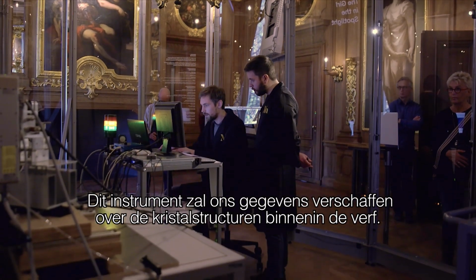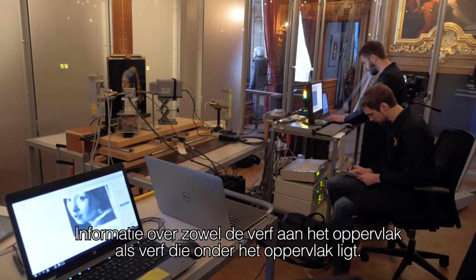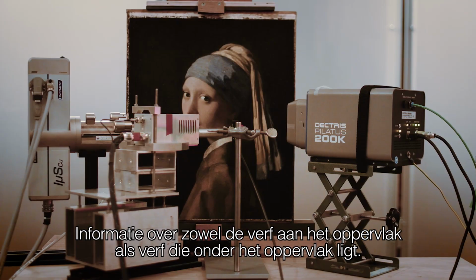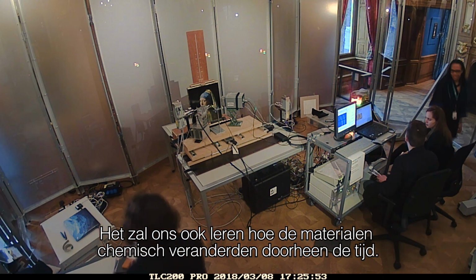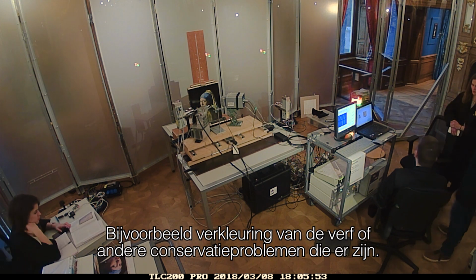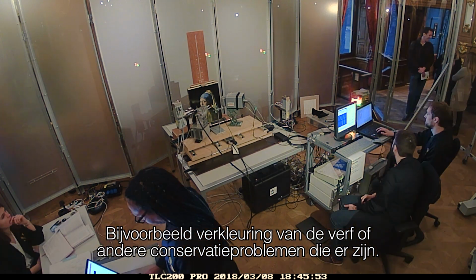This instrument will give us information about the crystalline compounds inside the paint stratigraphy. It will give us information about the painting materials which are present at the surface, but also the painting materials which remain hidden under the surface. It will also tell us how these materials have changed chemically over time. For instance, discoloration of the paint or other conservation problems that are going on.